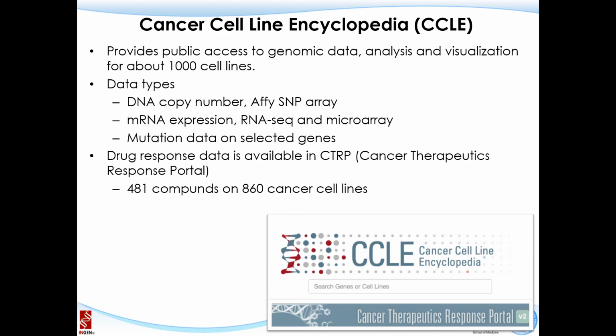They identify a couple of different levels of information, including the DNA level, more on the DNA copy number variation and the SNP array data. And this is important, they also did a lot of RNA level analysis, and I think most of them have the RNA sequencing data available, and also some of the mutation data.